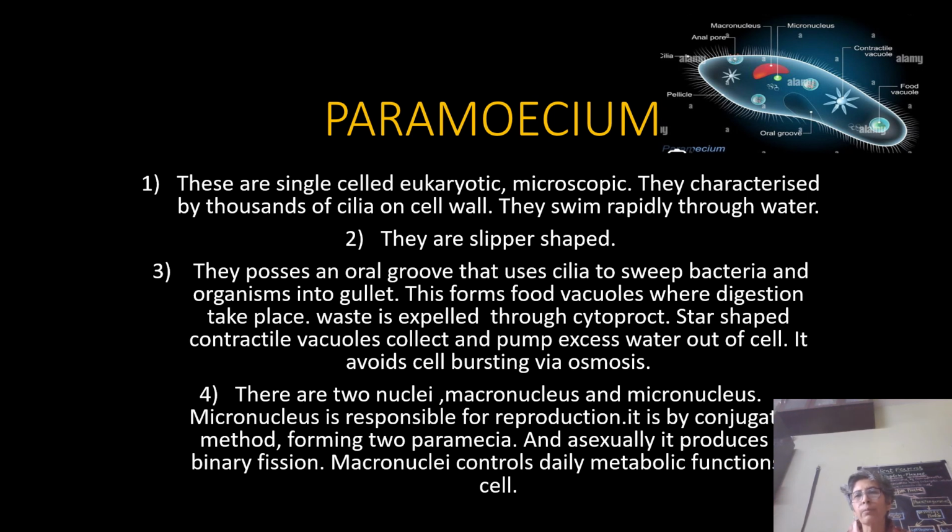The macronucleus controls metabolic activity in the cell. These are the functions of the nuclei. So this is about paramecium.